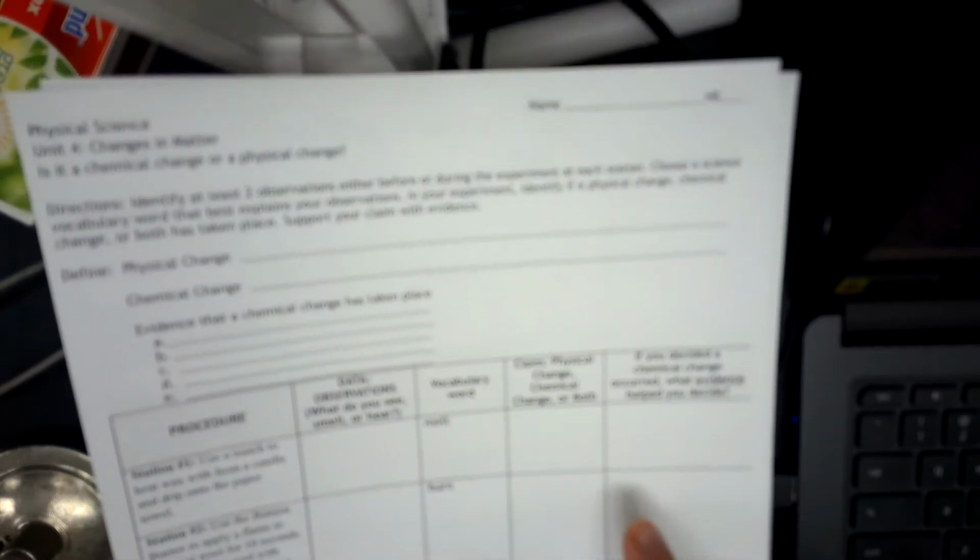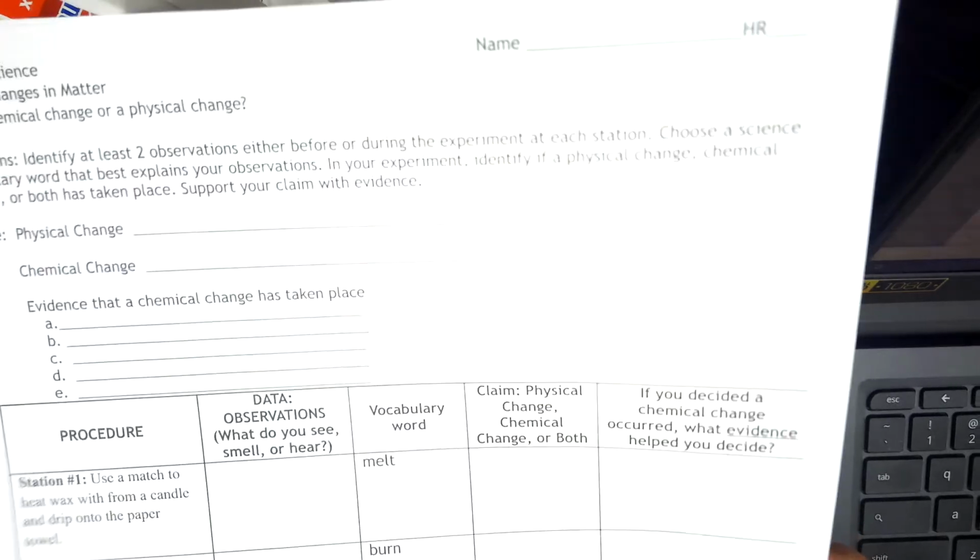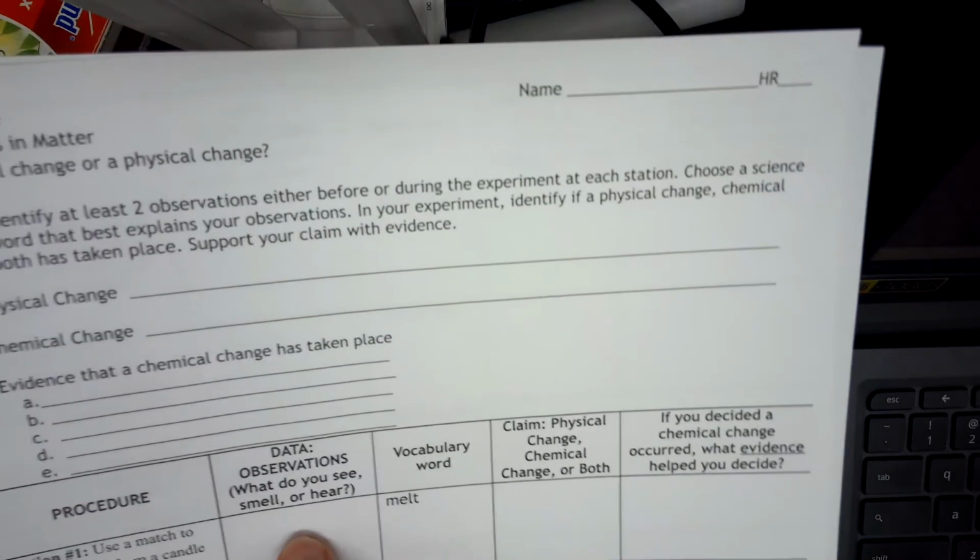Today we are going through the Station Lab, Changes in Matter, or Physical versus Chemical Changes Lab. It's the one that looks a lot like this. It's got some stuff for you. Today you're going to be writing down your data, or observations, based on what I do.